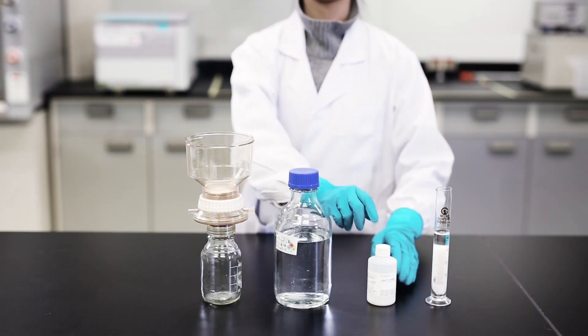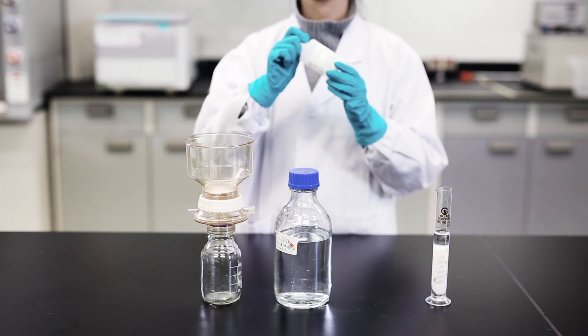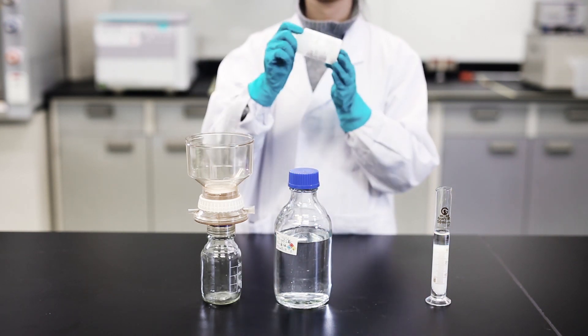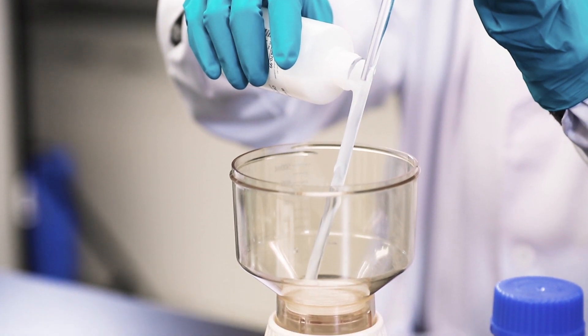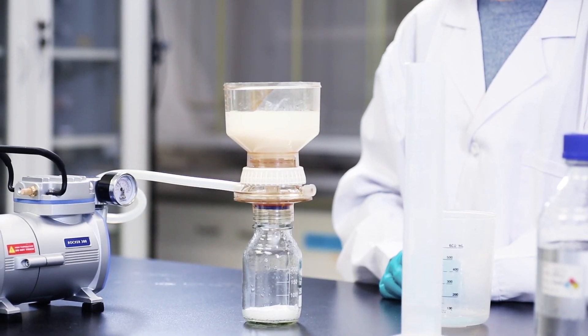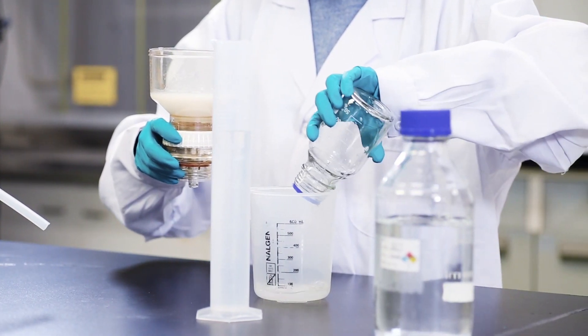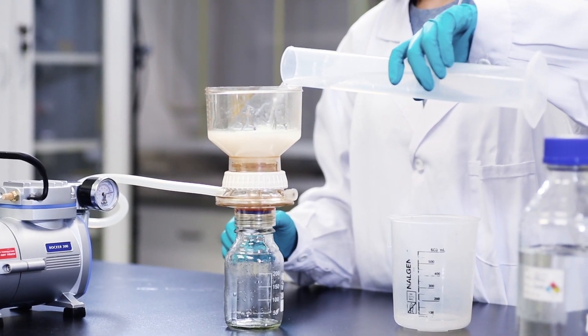Ensure that the resin is washed thoroughly into the packing solution before packing is started. Use a fritted glass funnel to wash the resin over to the packing solution. Suspend the resin by shaking it gently and pour it into the funnel.